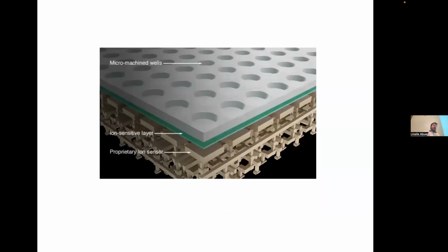So the way it works, the invention really has been this. So this is a semiconductor technology. There's millions of wells on that, and under each well, you have a sensor, an ion sensor. So very similar to 454, but instead of being light, it is going to detect H+, right, the proton. So you throw some A's, and every time you have a peak in H+, that means the A was incorporated. You wash it, throw some C, and you keep going like that. So it has exactly the same program as for 454, right?